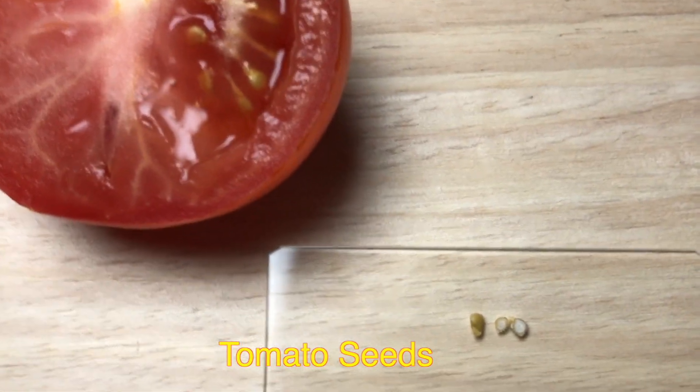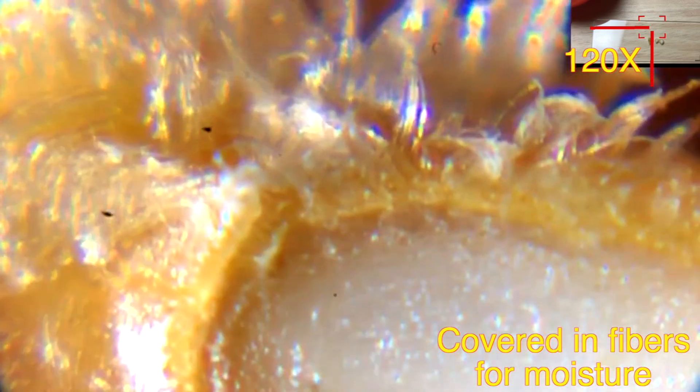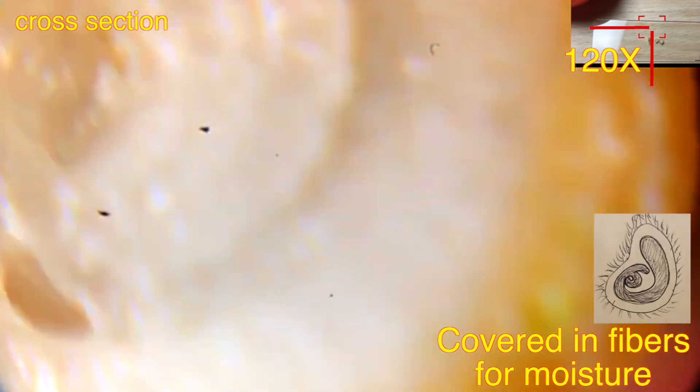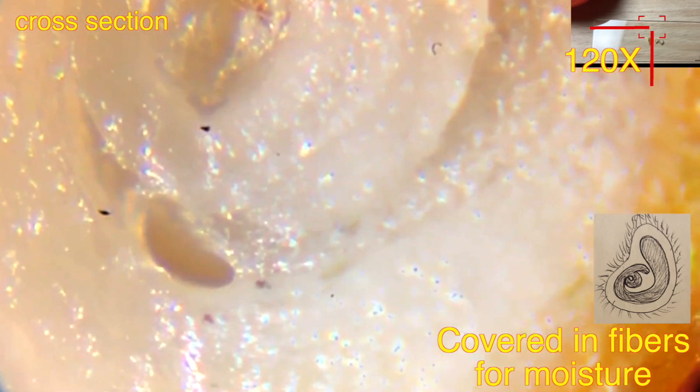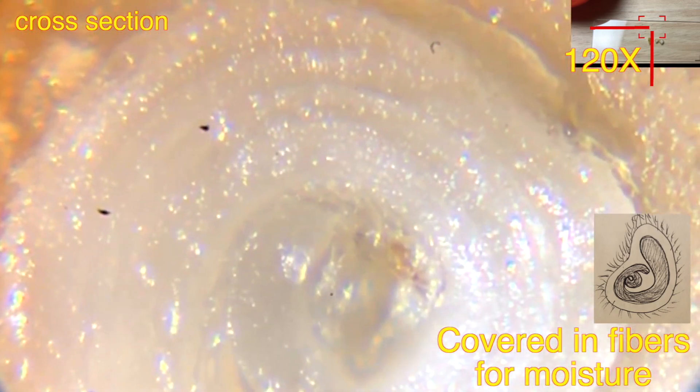These are tomato seeds — we will be looking at them under the microscope. This is the outer cover of the tomato seed, and you can see the fibers around it that hold the water. In the cross-section, the seed inside is a little bit spiral in shape, which is pretty interesting.